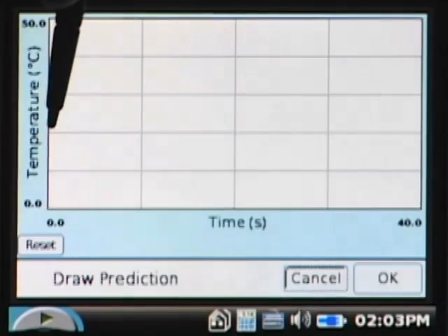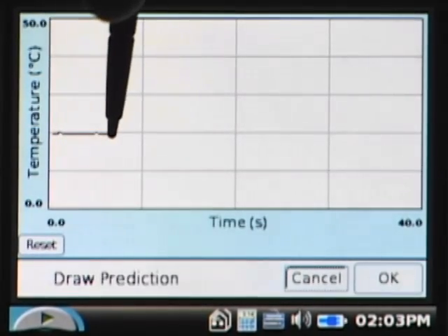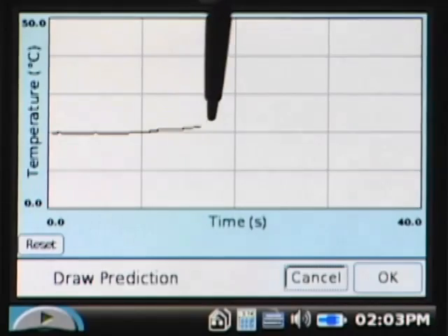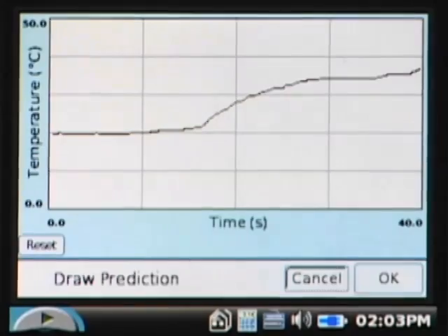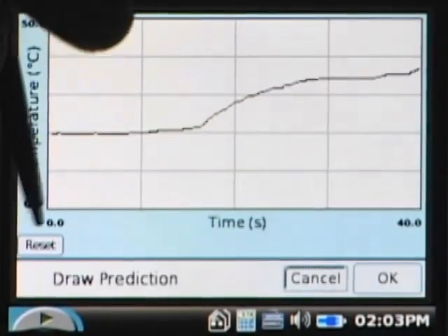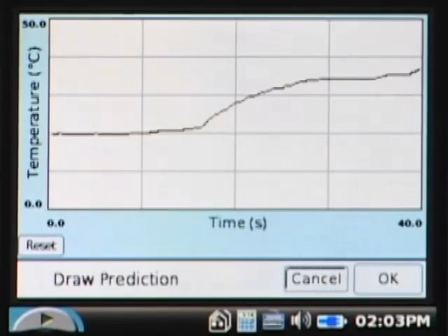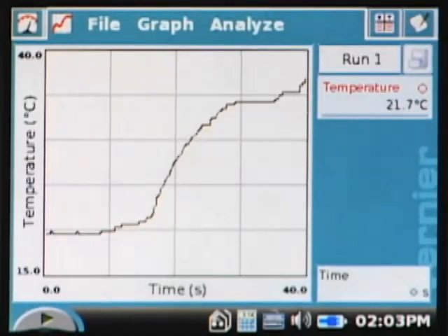It gives me a screen where I can draw the prediction. I'm going to say, well, maybe it goes along like this, and I add the baking soda, then maybe it gets warmer. If I don't like my prediction, I can always press reset and do another one, but I'm fine with that one. It draws my prediction on the graph.